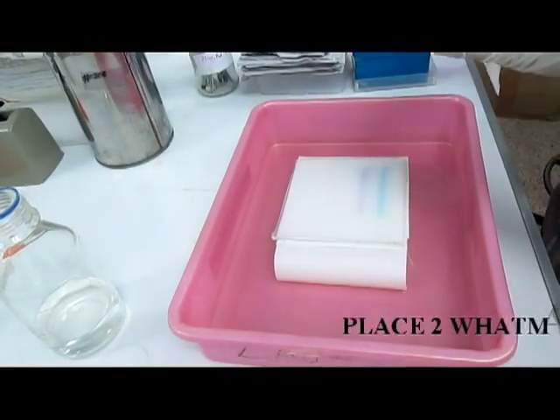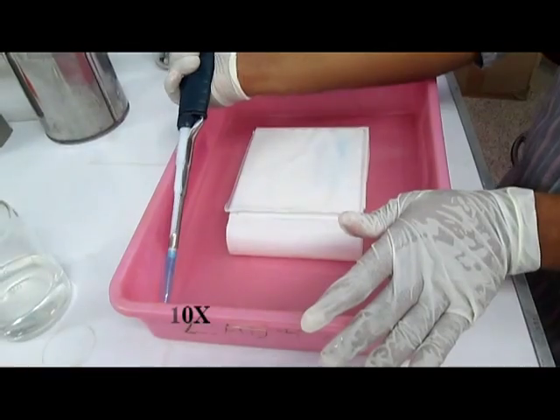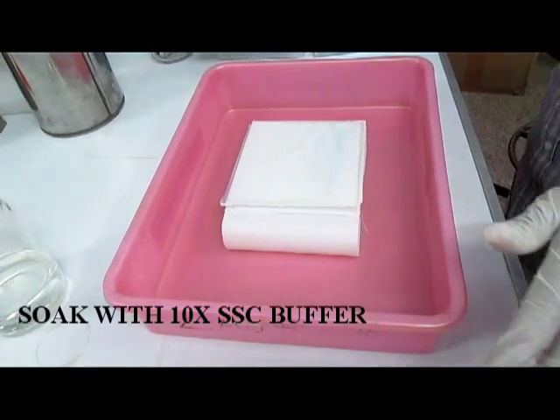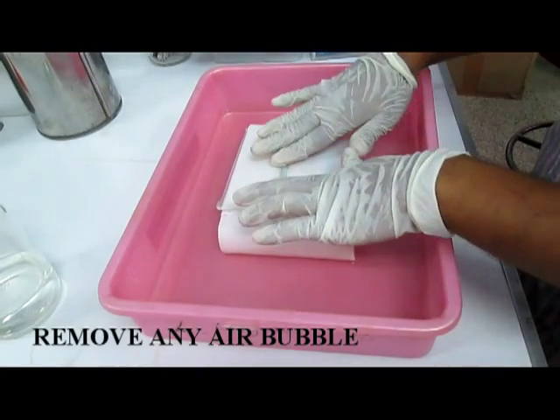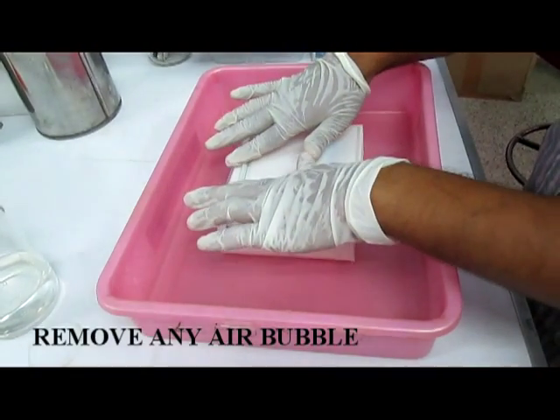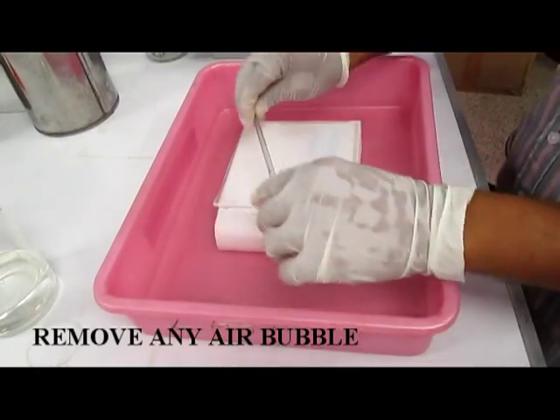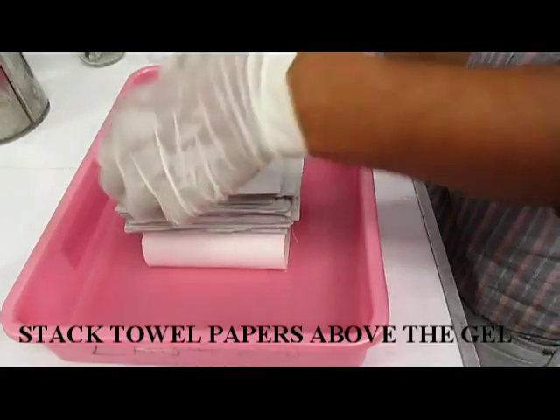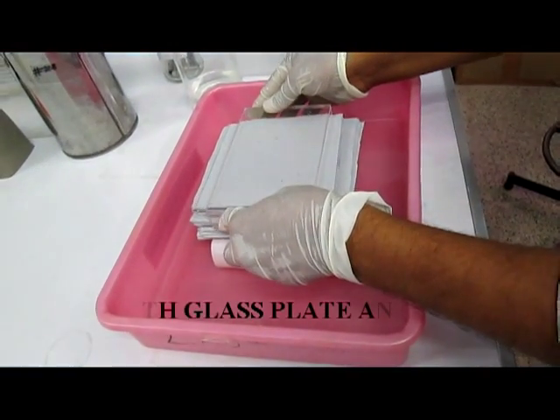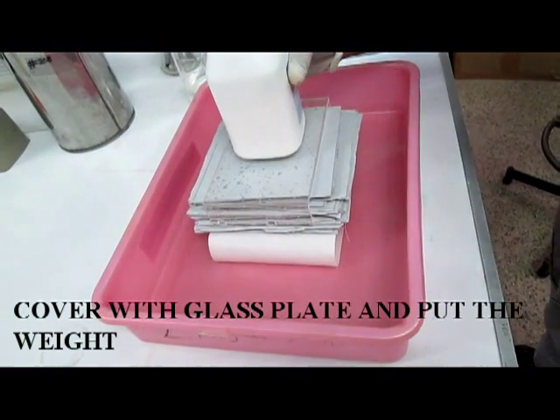Put two layers of Whatman paper having the gel size. Then soak the paper using 10x SSC buffer, and carefully remove the air bubbles by passing the glass rod over the Whatman filter paper. Then place a bunch of paper towels onto the Whatman filter paper, then put the glass plate over the towel paper and keep a weight. Allow the transfer overnight or 18 hours.